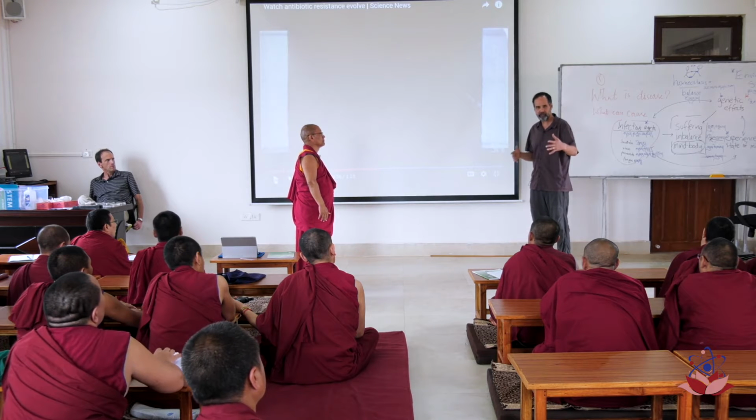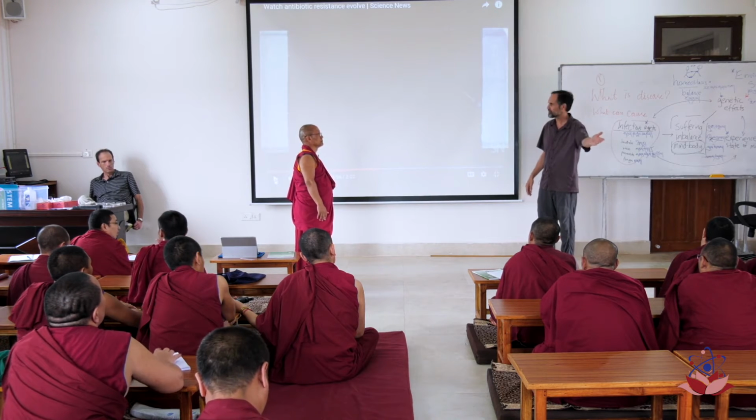So these are normal wild type, we call them bacteria. Normal bacteria that grow just presumably like this plate here.